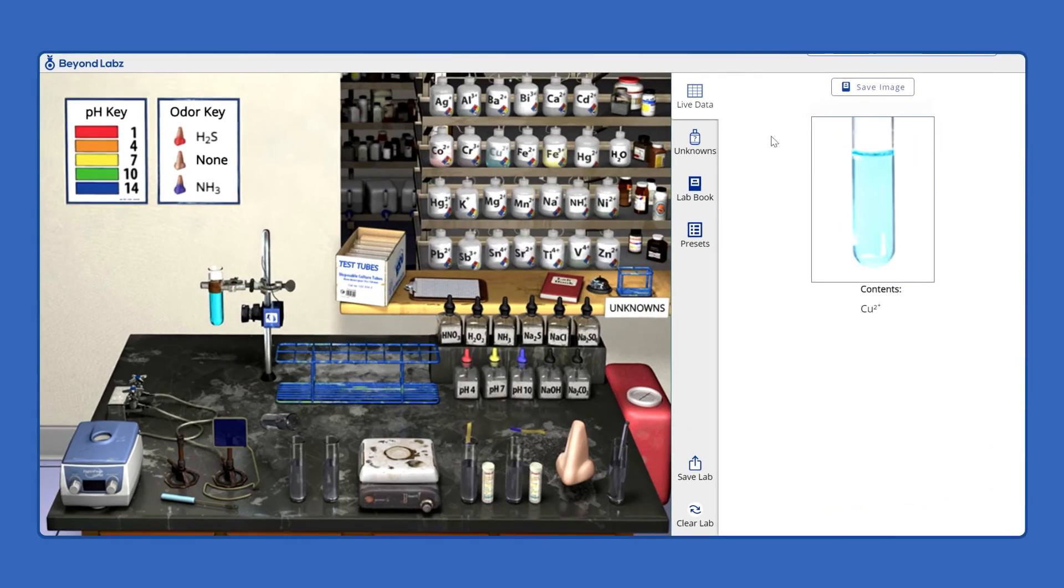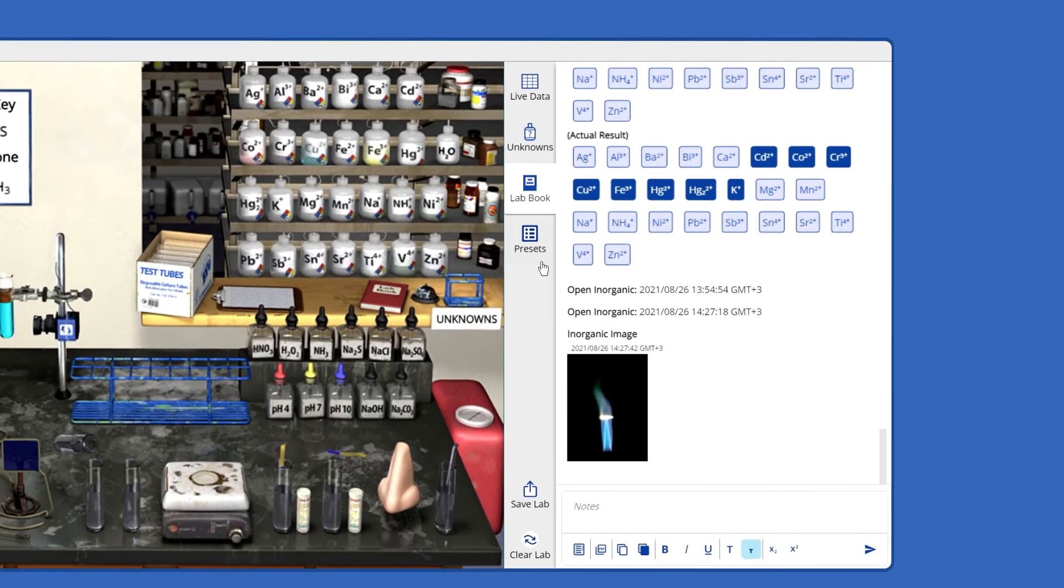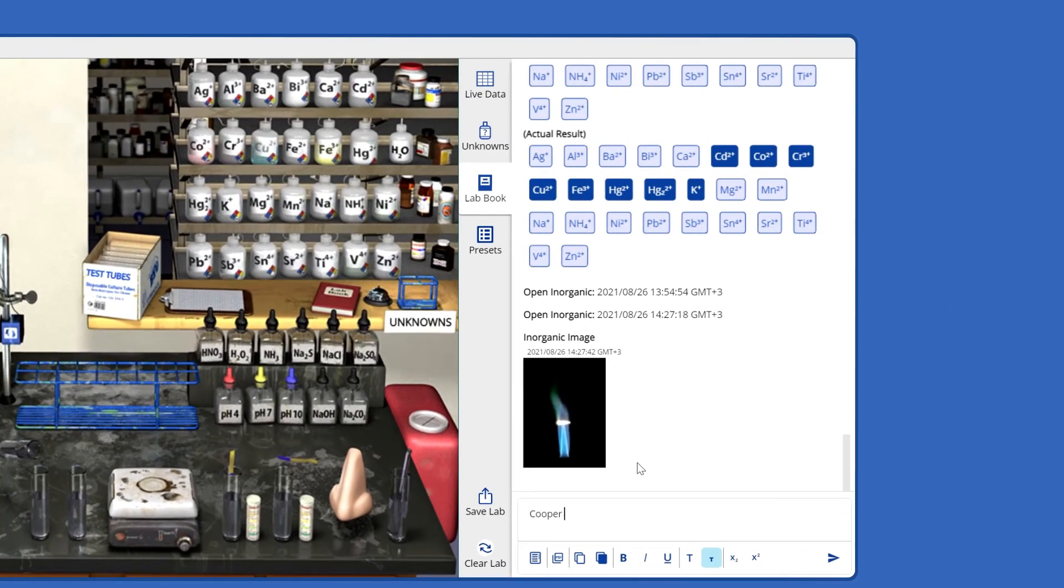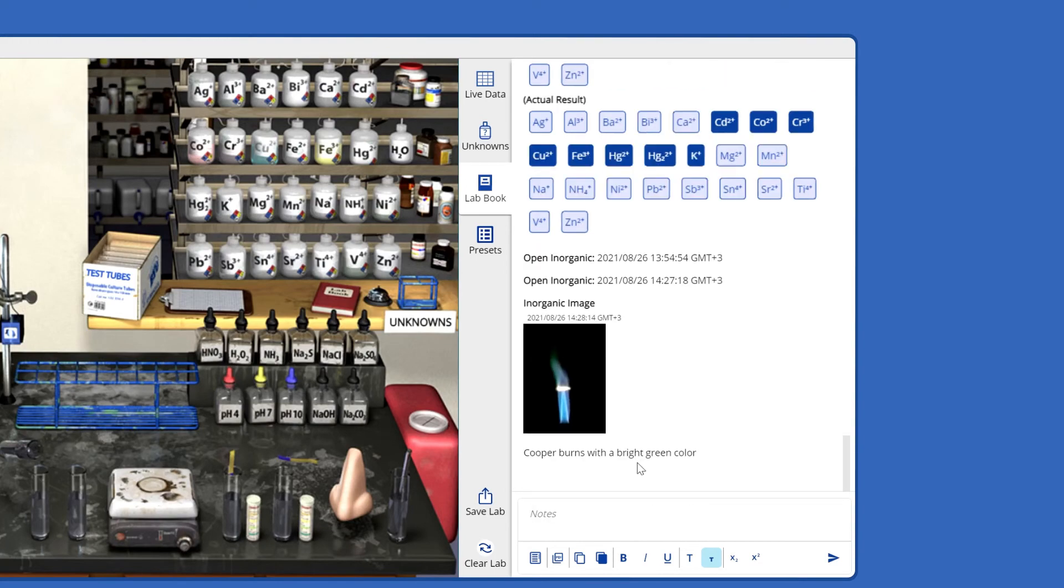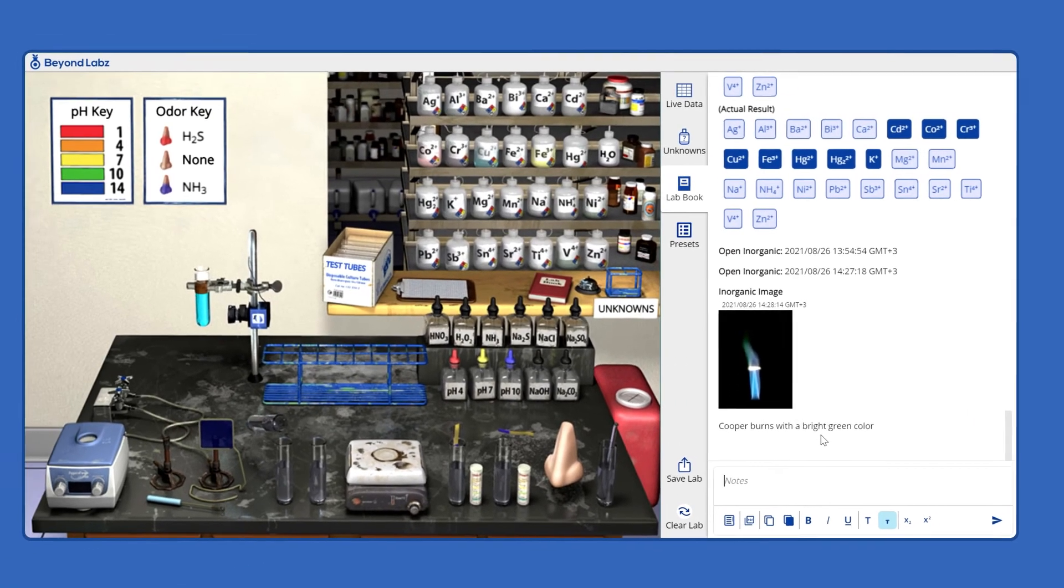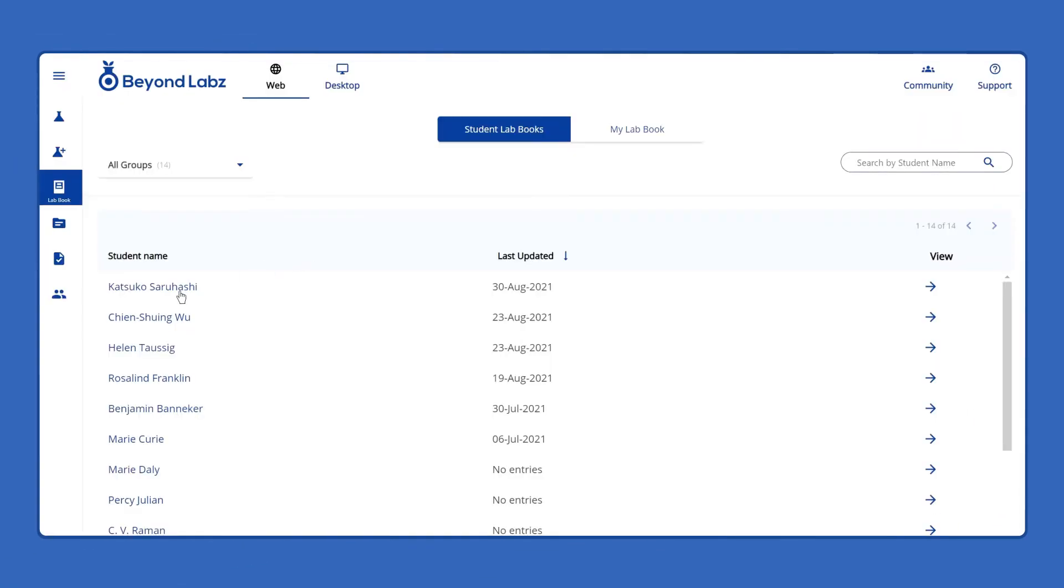To help prevent cheating and plagiarism, all student lab book entries are unchangeable, time-stamped, and viewable by instructors.